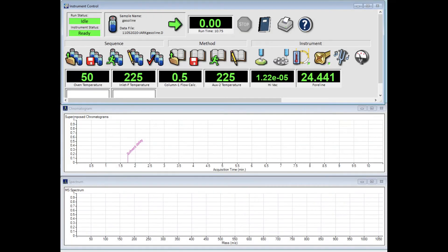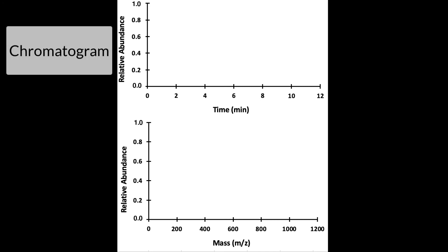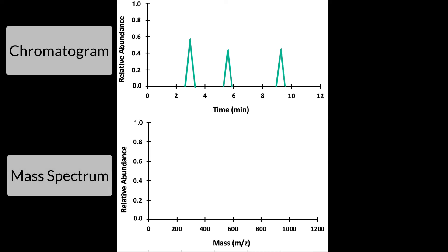Here is an example of what the software looks like. This is what you would obtain from the GC-MS. The top is a chromatogram showing relative abundance on the y-axis and time on the x-axis. A peak appears when a molecule elutes at a specific time from the column. The bottom is a spectrum showing relative abundance on the y-axis and mass-to-charge on the x-axis. This tells us the mass-to-charge is detected for any given peak.